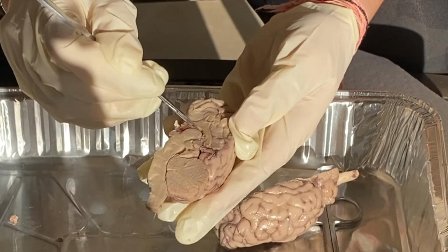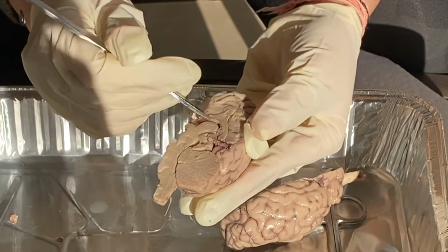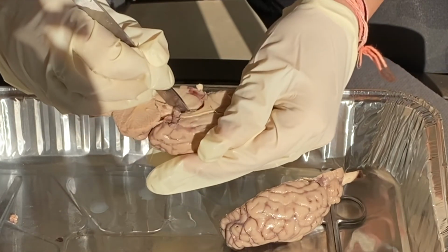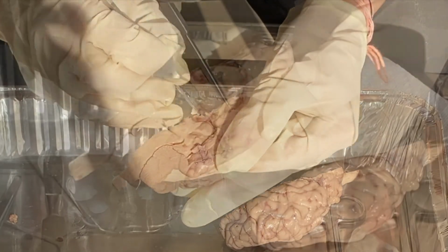So I'm going to try and find the choroid plexus cells here. That should be located on the roof of the 3rd ventricle. So this is the 3rd ventricle right here. It's the space in the brain. And I'm going to just dissect a little bit here to see if I can find that structure.